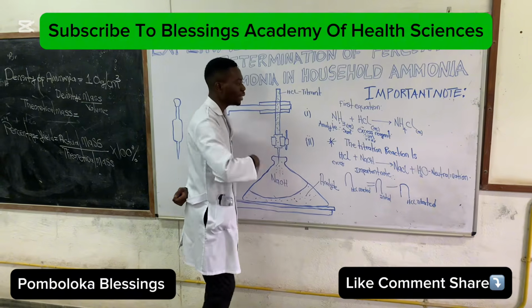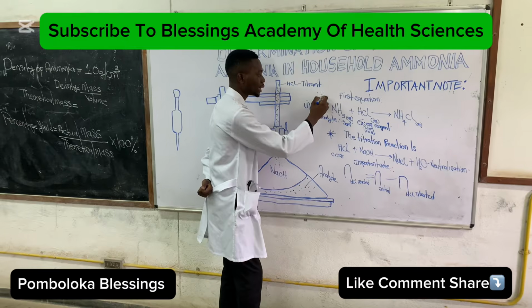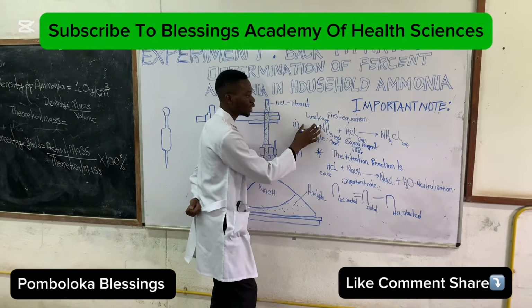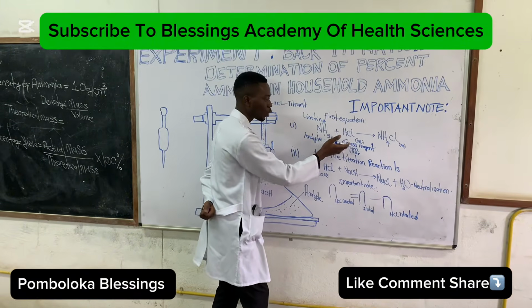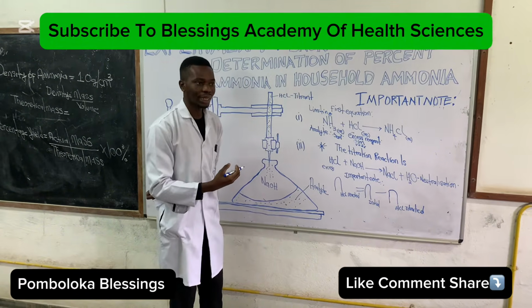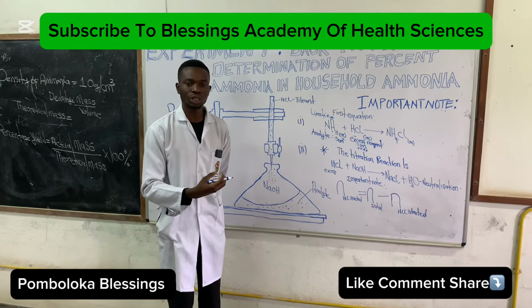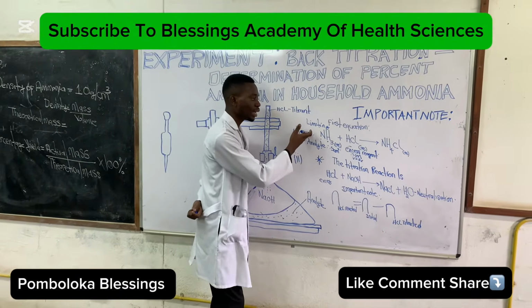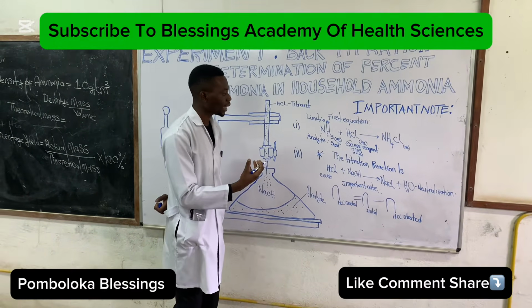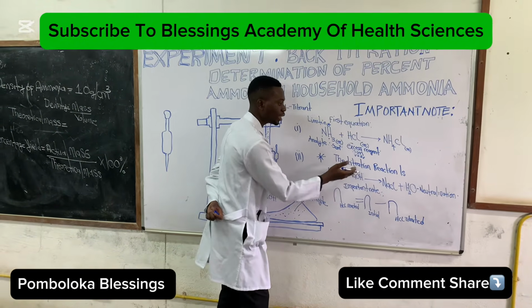The basic principle here is that the ammonia is going to be the limiting reagent in this chemical reaction. It's going to react with the excess HCl to give us the product. When this reaction happens, the ammonia will be completely diminished during the course of the reaction because it is the limiting reagent. Since we still have HCl, it is going to take part in the second part of the reaction, where you have the titration reaction.